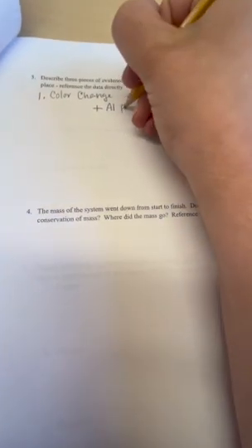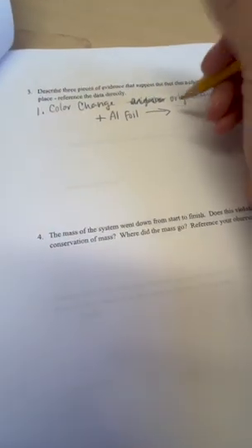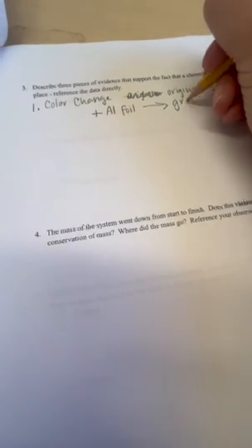And then we added aluminum foil, and we saw that color go from blue to a greenish, rusty red kind of color.